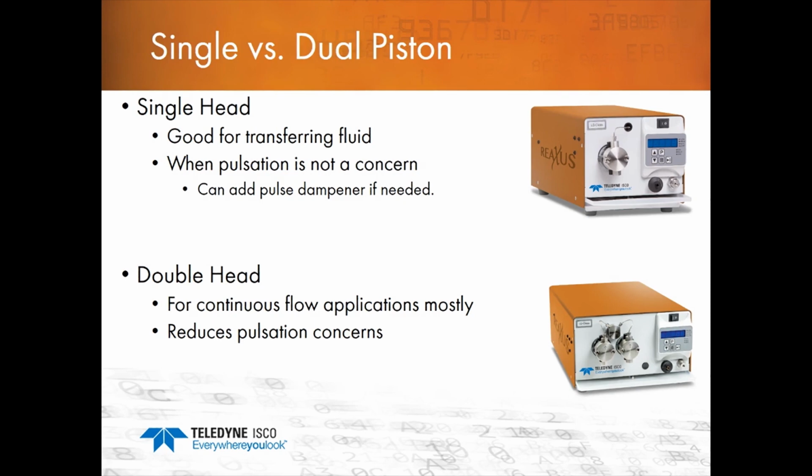Lots of times we'll talk to people that use multiples of these to move different chemical agents or chemical reagents through a flow chemistry application, where all they need is to move it in there at a steady rate. And it's got to come in on the left side at 10 mils a minute. It's got to come in on the right side at 5 mils a minute, and then it's got to come in from below at 3 mils a minute. So it's a very nice, even flow, okay?